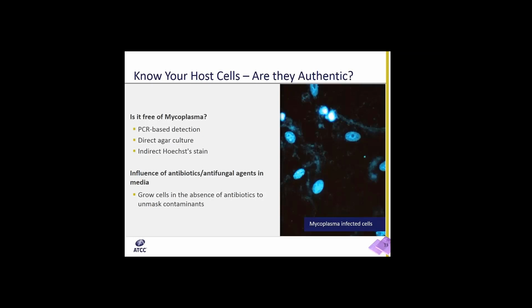We also have PCR-based detection as well as direct agar culture methods. The direct culture method is quite long. It requires both agar and broth media to permit the isolation of cultivable strains, and they appear as characteristic colonies on agar medium.